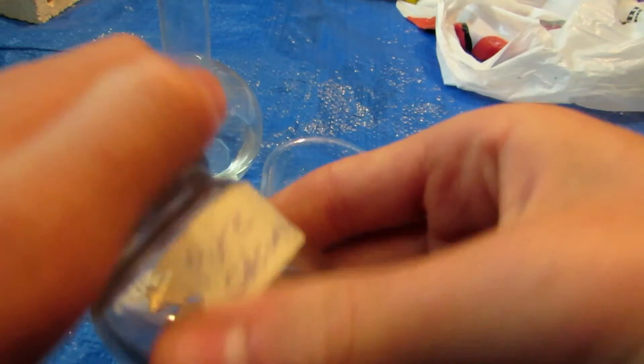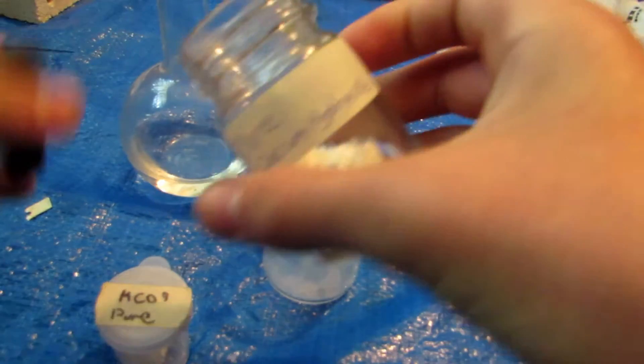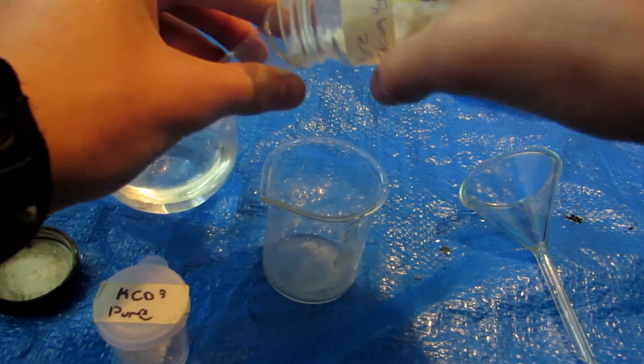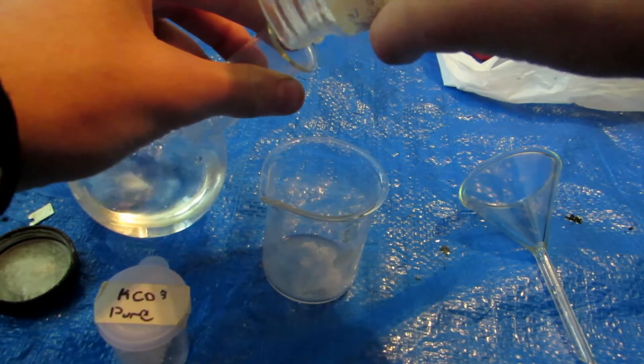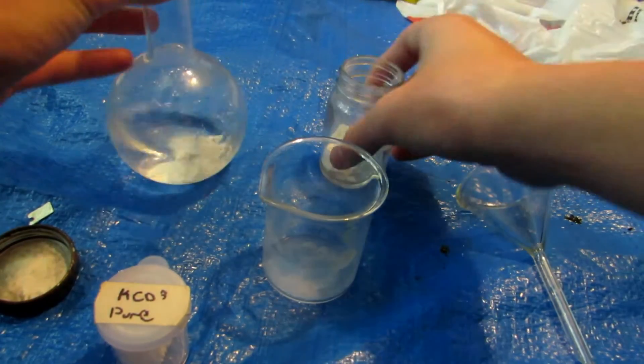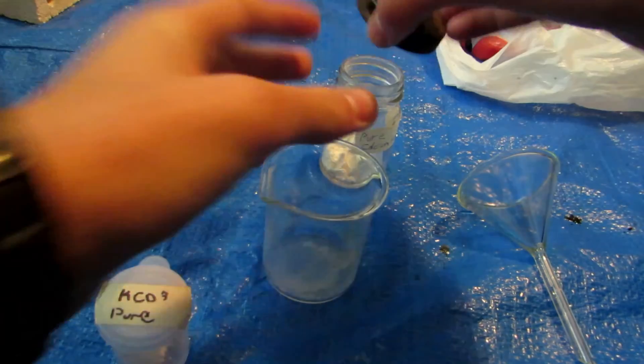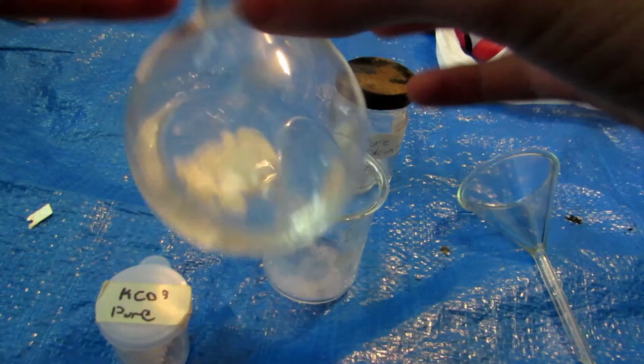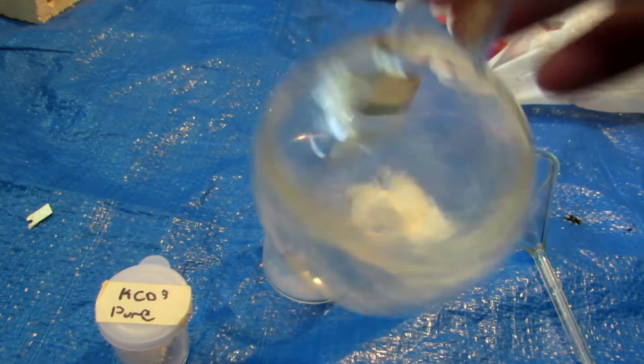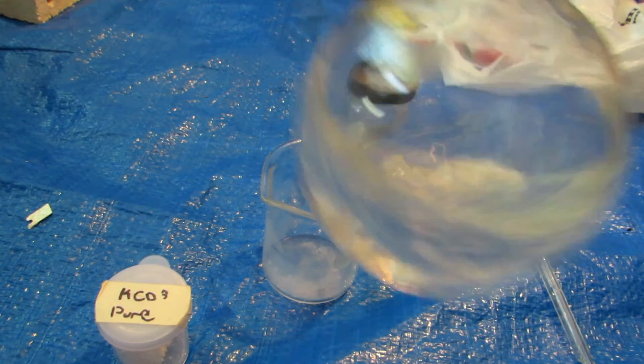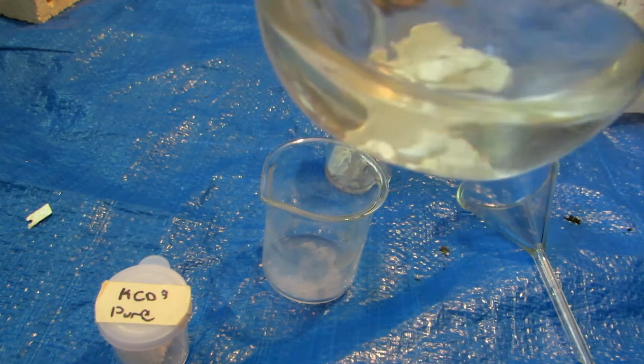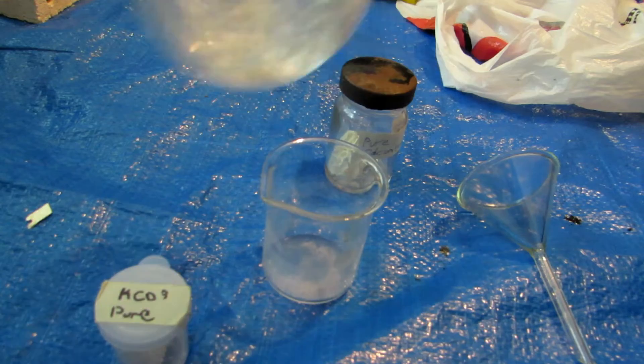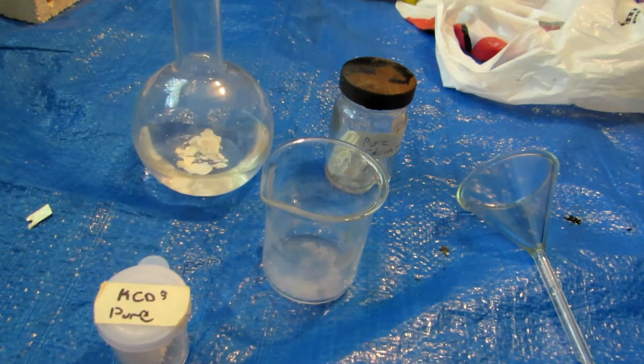So first step we're going to do is simply take some of our calcium hydroxide here and just pour it into our round bottom flask with a flat bottom of course so it will stand. You can use any sort of container, even something like a canning jar or something.